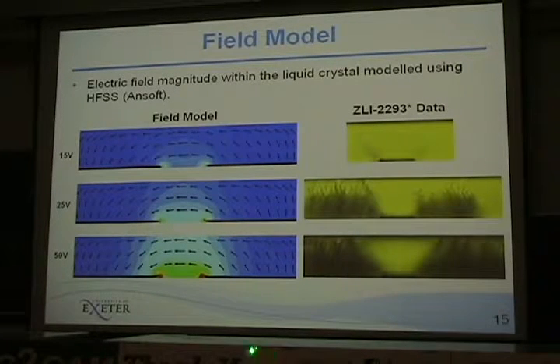Also, actually, at the edges of the cell, we're getting quite reasonably strong field lines emerging perpendicular to our silver substrates right up in this direction. So again, that accounts for the cholesteric pitch, which is extending in sort of tens of microns in this direction and that direction through the cell. So this is again the 2293 responding to the fields.